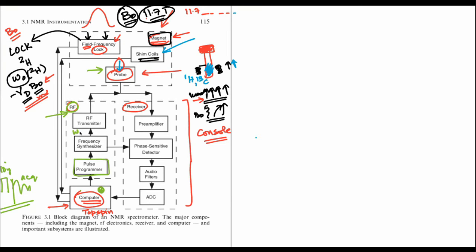And you start applying the omega RF in this place. Remember, we had this cos of omega RF t plus phi. Of course, the phi we just set as the Y phase. And of course, there's also a B1 that you have up front. The B1 is what is deciding whether it's a 90-degree pulse or whatever flip angle it is. Well, the omega RF gets added up by this frequency synthesizer. We will see why it is coming back later on in the receiver in a little while.